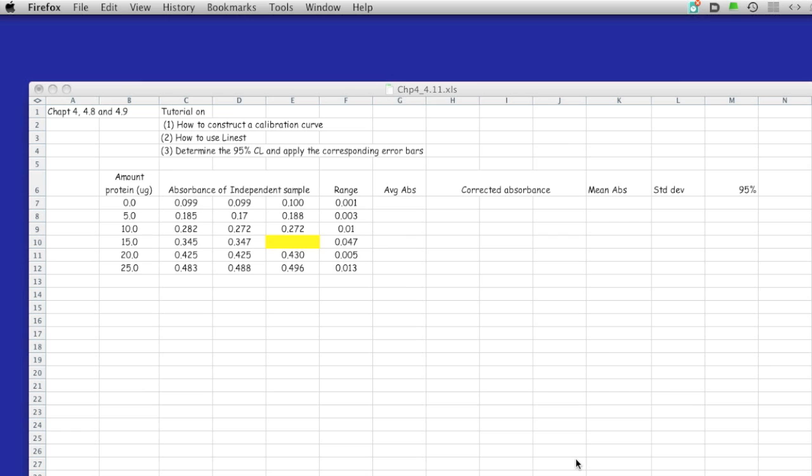In the first part of this tutorial, we're going to do the corrected absorbance. In order to do the corrected absorbance, we're going to have to take the absorbance reading and subtract the 0 or the blank sample.